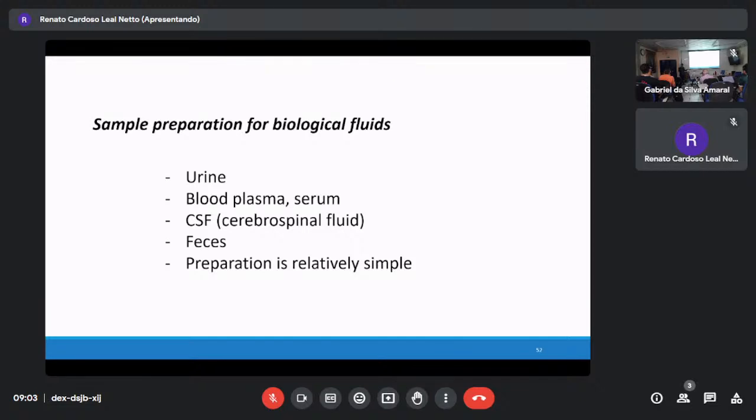Once, as I mentioned, we collect it, it's a perfect method because it's a liquid, and it's directly injected into the instrument. Even CSF, you don't need HPLC. Direct infusion method is possible. But the problem is you need to collaborate with the hospital and you need to handle medical issues. And this is the worst example which I have ever handled. What's the problem?